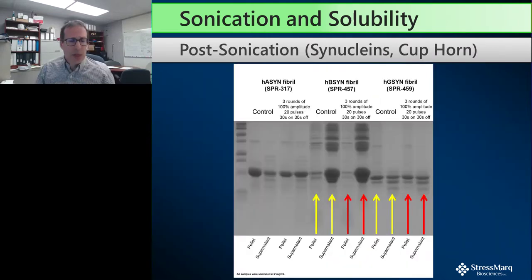So again, we thought we'd use a different sonication protocol and just have a look at what was happening from a solubility perspective. This is using a cup horn system, which, at least in our case, is far less efficient than using a probe because we're not in direct contact with the probe head. However, you can see on the left-hand side, we have begun to push some of the material from the control side, that was originally the pellet, into the supernatant, just as we would expect.